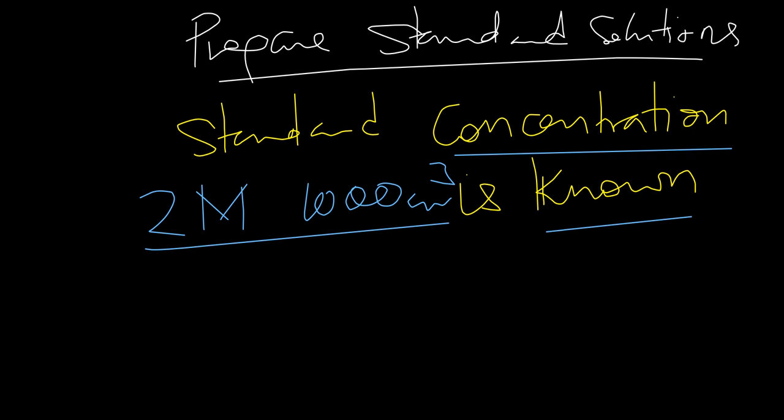Now, we are going to look at how to prepare some of these standard solutions. However, before we move on to the preparation of these standard solutions, it's very important we look at some of the tools that can help us prepare them. So we'll start with some of them. So let's look at the first tool. Now the first tool is the spatula.